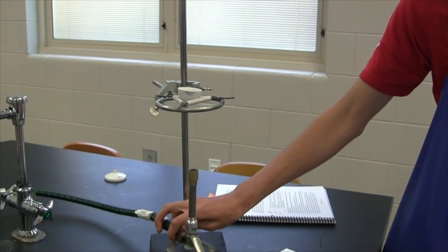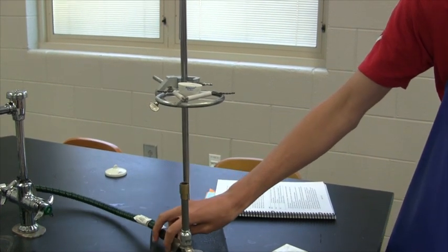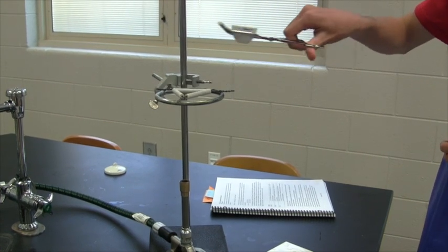Heat the crucible with the hottest part of the flame for three minutes. Using your crucible tongs, remove the crucible from the clay triangle and set it on the ceramic tile to cool.